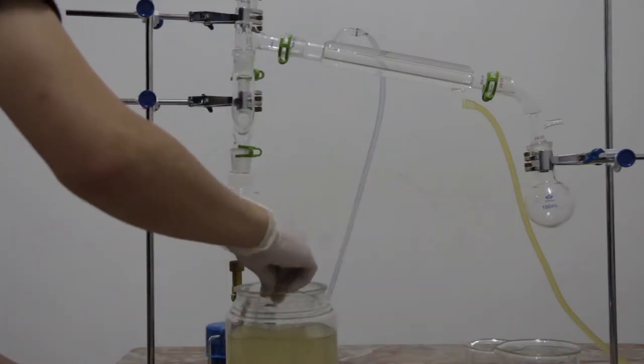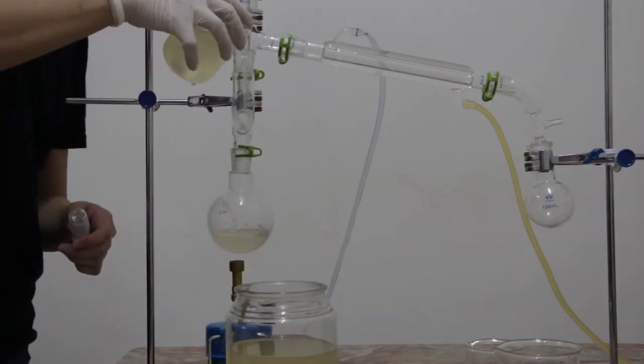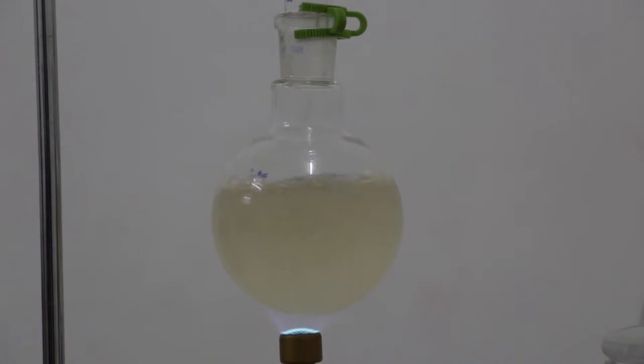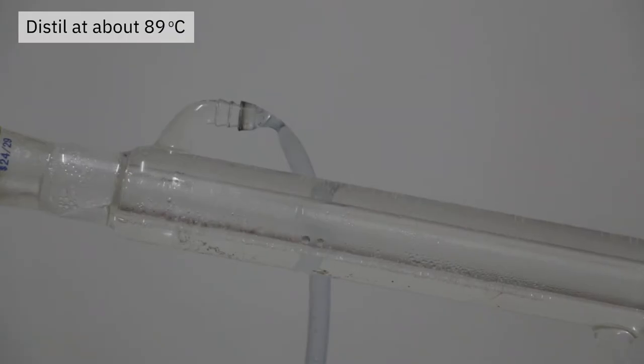The solution is then transferred from the fermentation vessel to the flask using a beaker. The solution is then heated and the distillate is collected at a temperature of roughly 89 degrees Celsius. This process is repeated with the remainder of the solution.